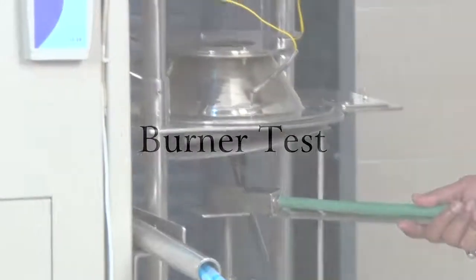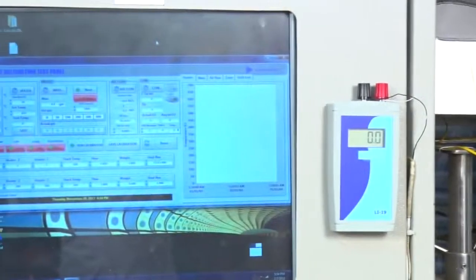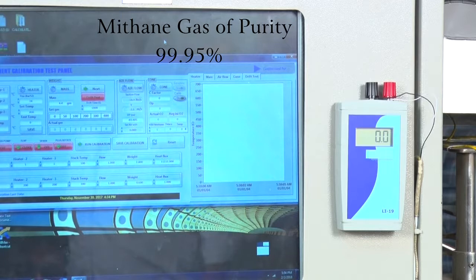Now coming to the Burn Test. We have a Burner here which we keep under the Retainer Frame without switching on the Cone Heater. This is the Burner, and this is the Methane Gas Cylinder which has a purity of 99.95%. By this test, we can verify the accuracy of the Cone Calorie Meter.